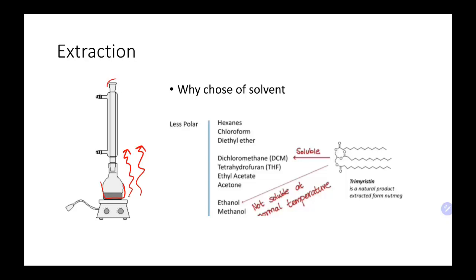So once you get this heating in your sand bath and you get the temperature to the boiling, make sure you have just one of those microscale caps. You put the little septa in it, that little round plastic piece. Don't throw them away. They're a little expensive. And then your little metal cap. So it's this metal cap, it's kind of open in this area. And then you put the septa and just stick it on the top. Don't screw it in. You just want it to help with the vapors not coming off, but you don't want to tighten it or you're going to create too much pressure and that could be dangerous.